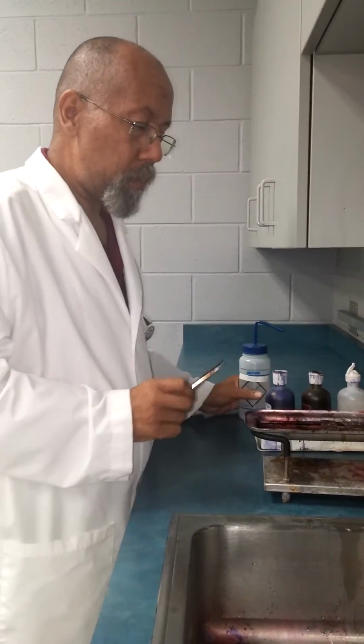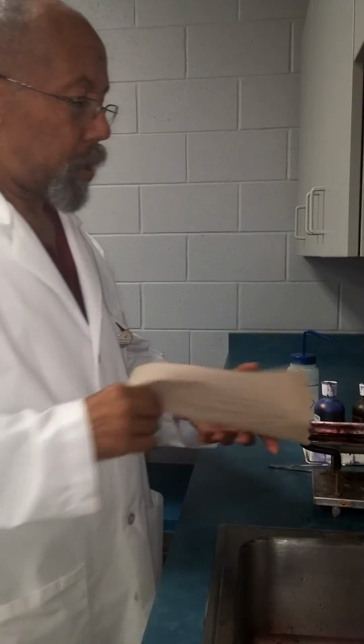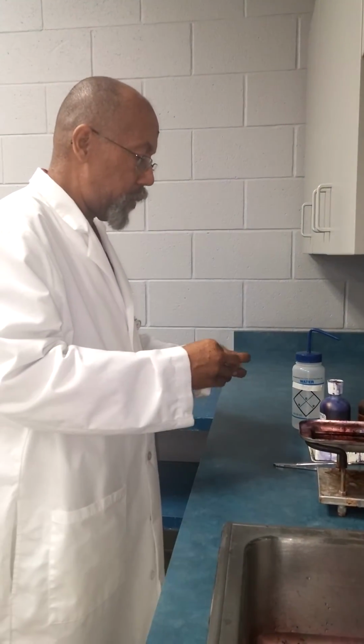And now our slides are ready to be read under the microscope.